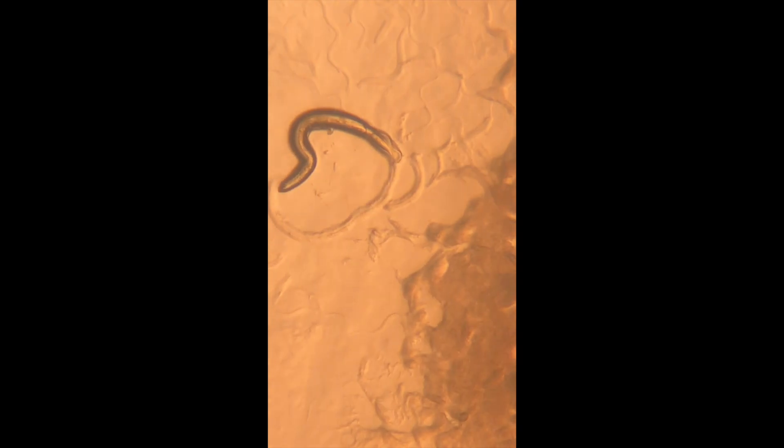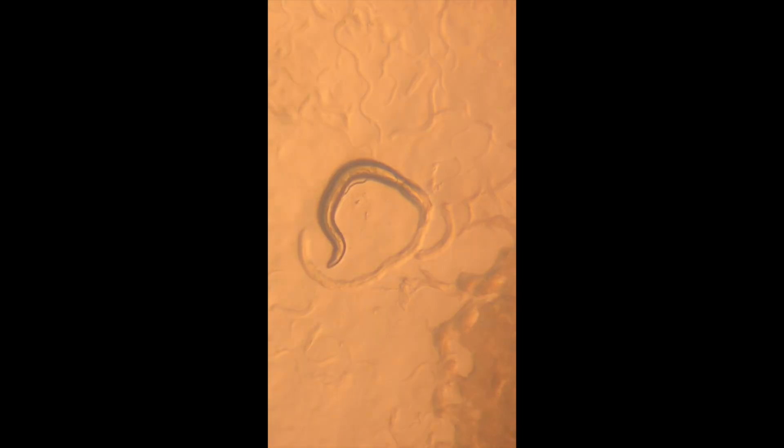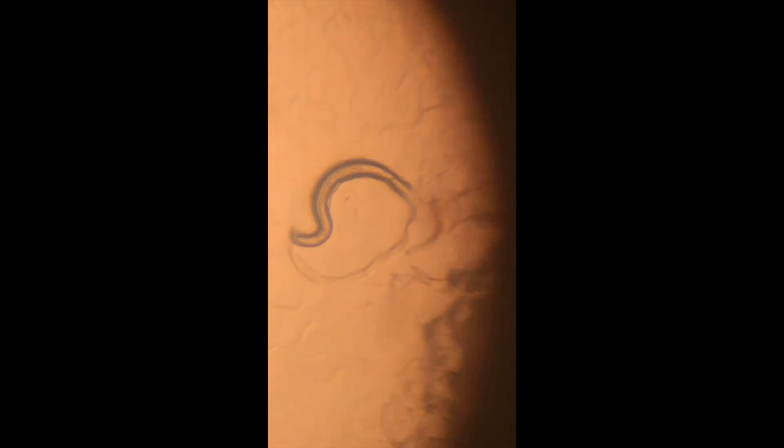Finally, here are the C. elegans affected by the blister gene. These worms had a phenotype of a large blister on them. This worm, for example, has a blister on its tail. The blister gene disrupts the structure of the adult stage outer layer causing the formation of blisters.